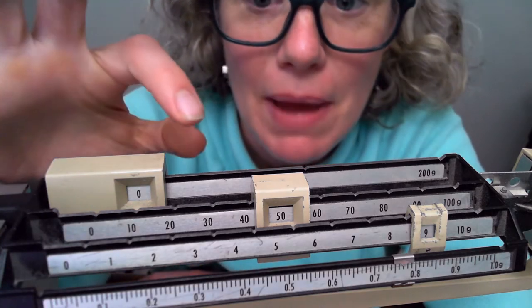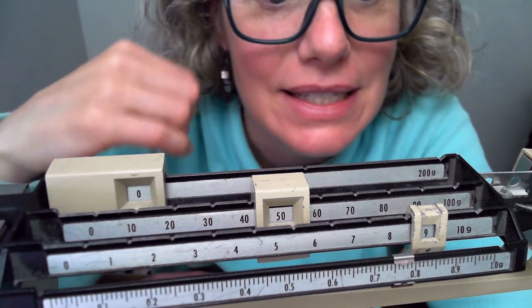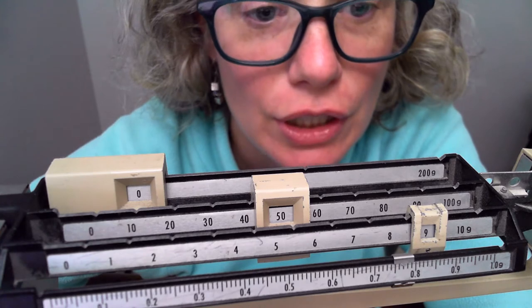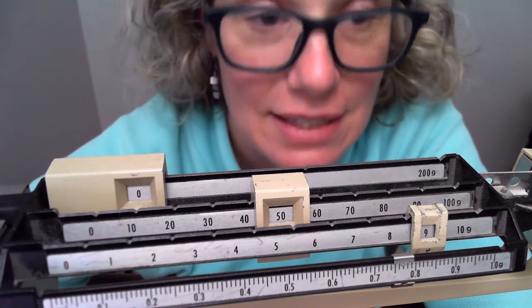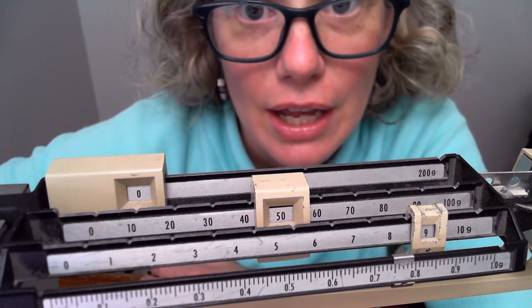Here is the new mass of the beaker and water combined. The mass reads 59 point 7, and it's a little more than point 75 but less than point 8 — two more lines beyond point 75 — so the combined mass is 59.77 grams.